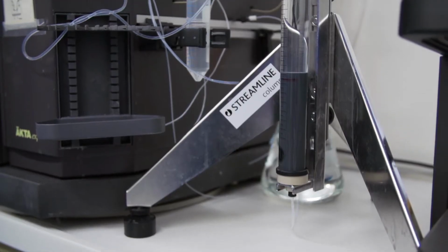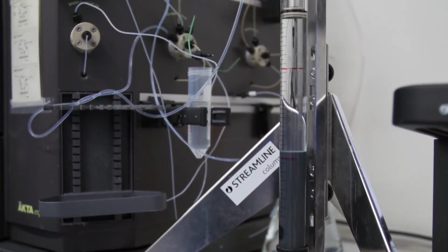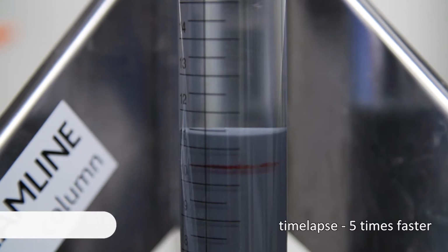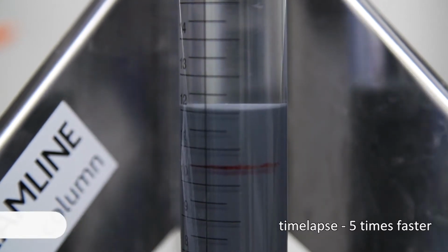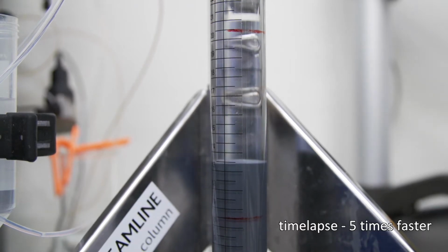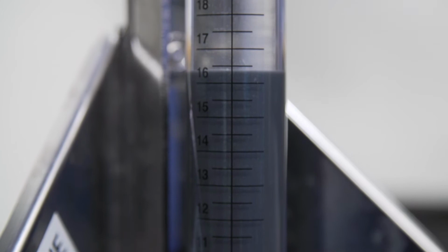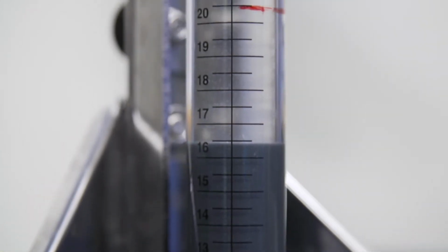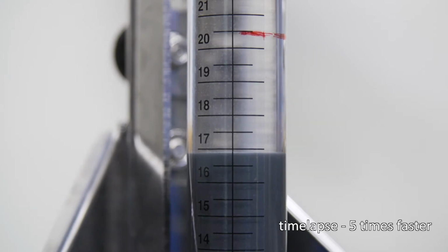In EBA, an appropriate stationary phase is fluidized by applying the mobile phase in an upward direction, generating a bed of enlarged interparticle spaces. The expanded void portion of a fluidized bed permits the application of a feedstock without clogging the bed. Hence, the purification of biomolecules by adsorption is an effective initial purification step for biomass-containing suspensions.